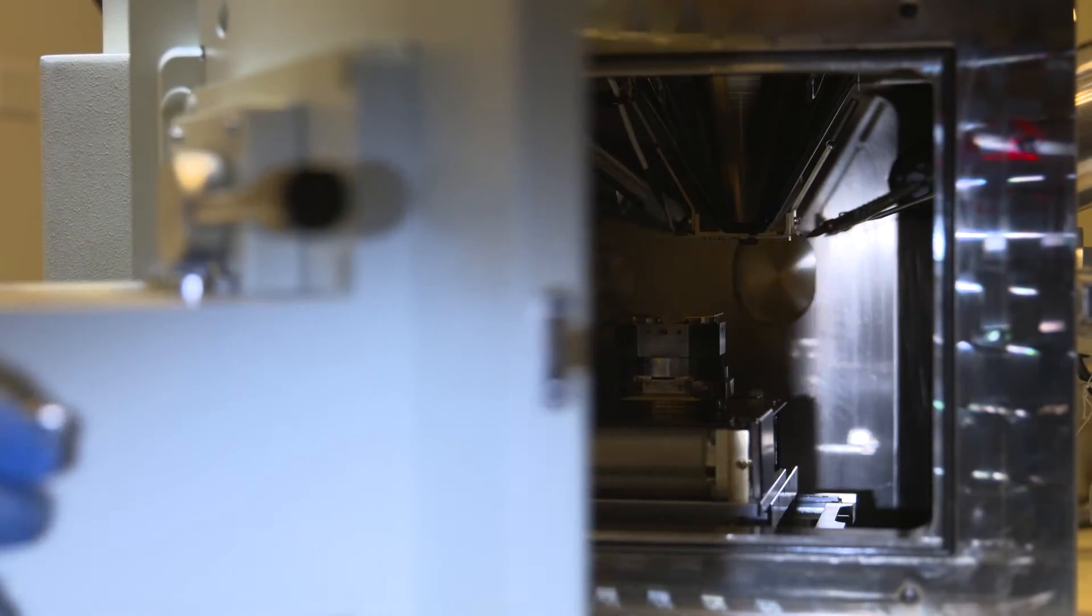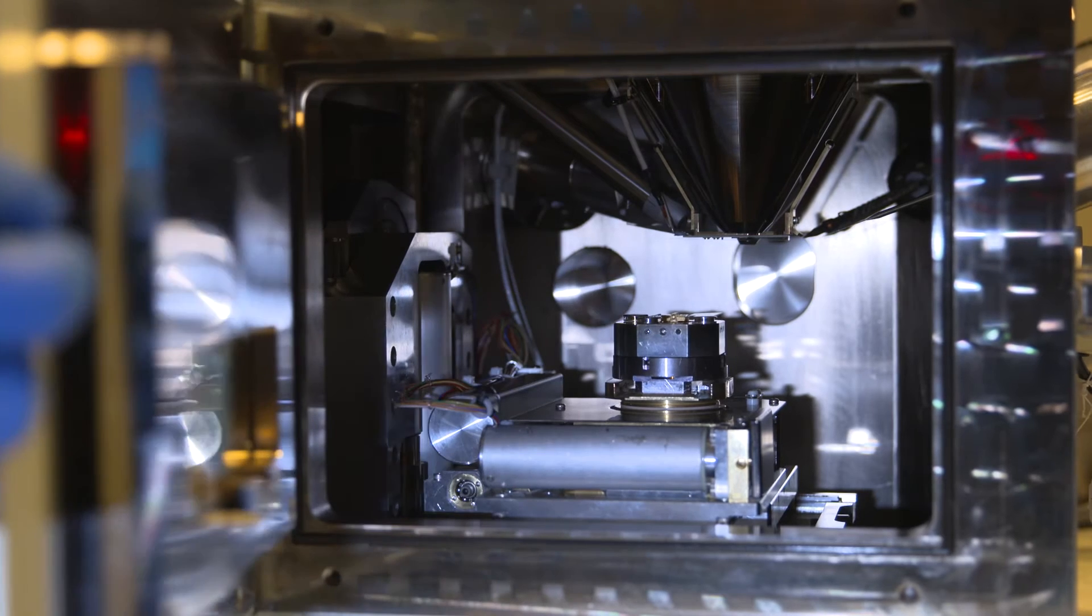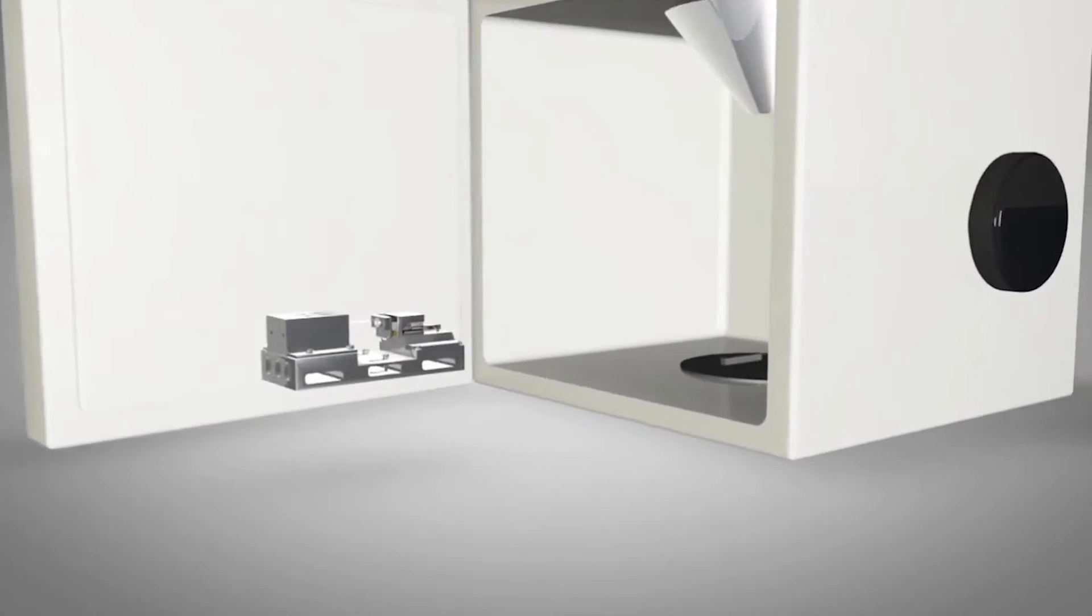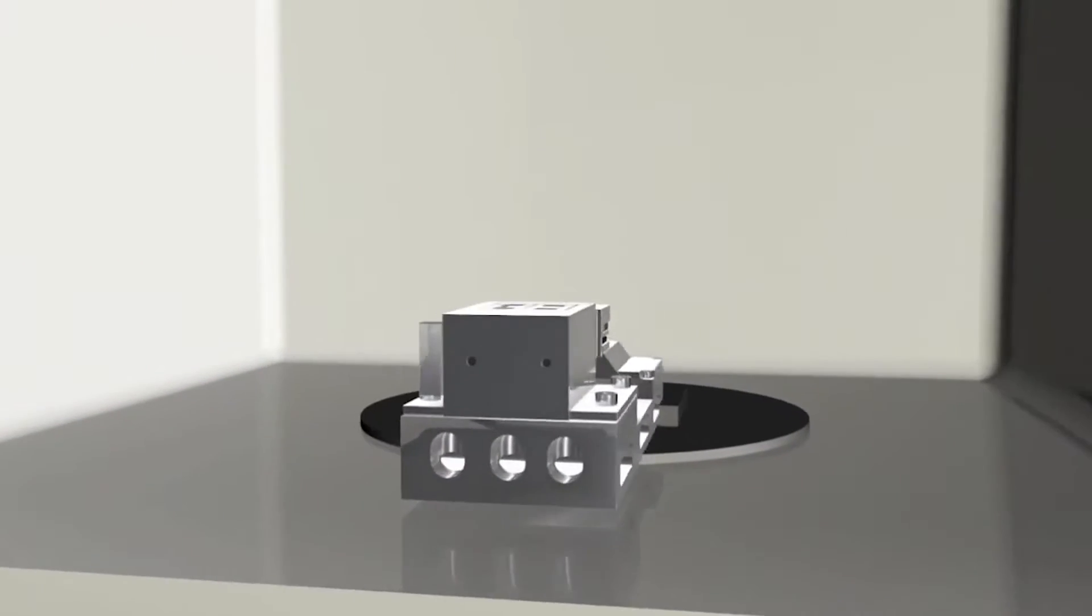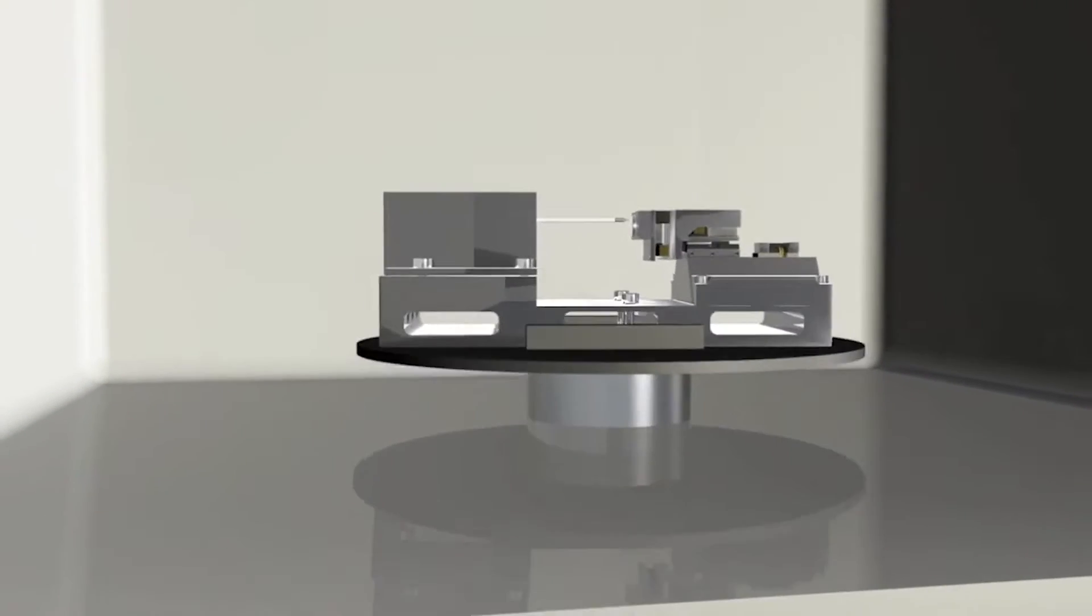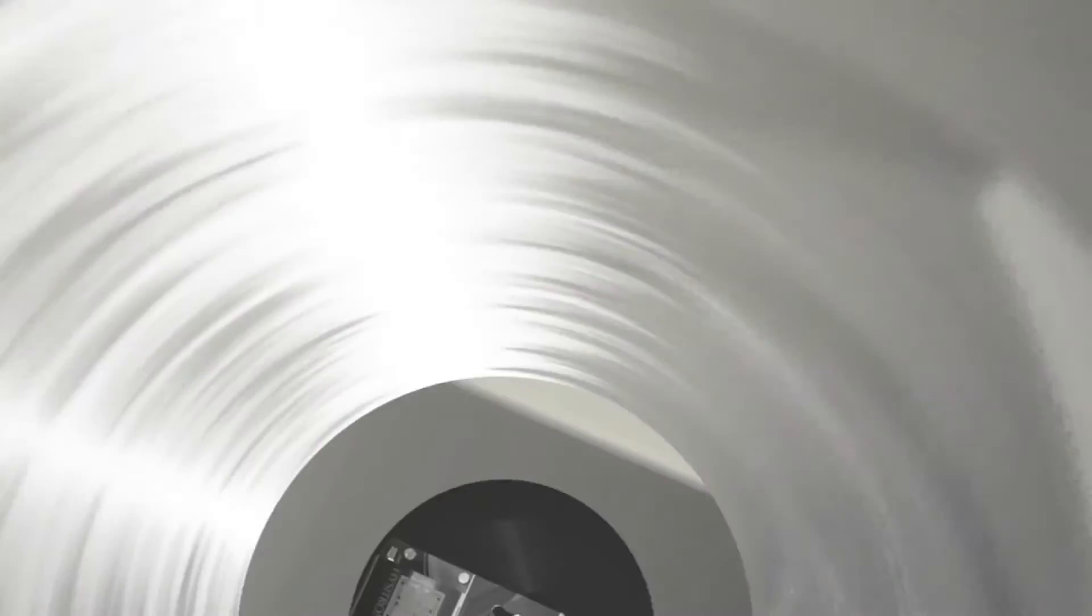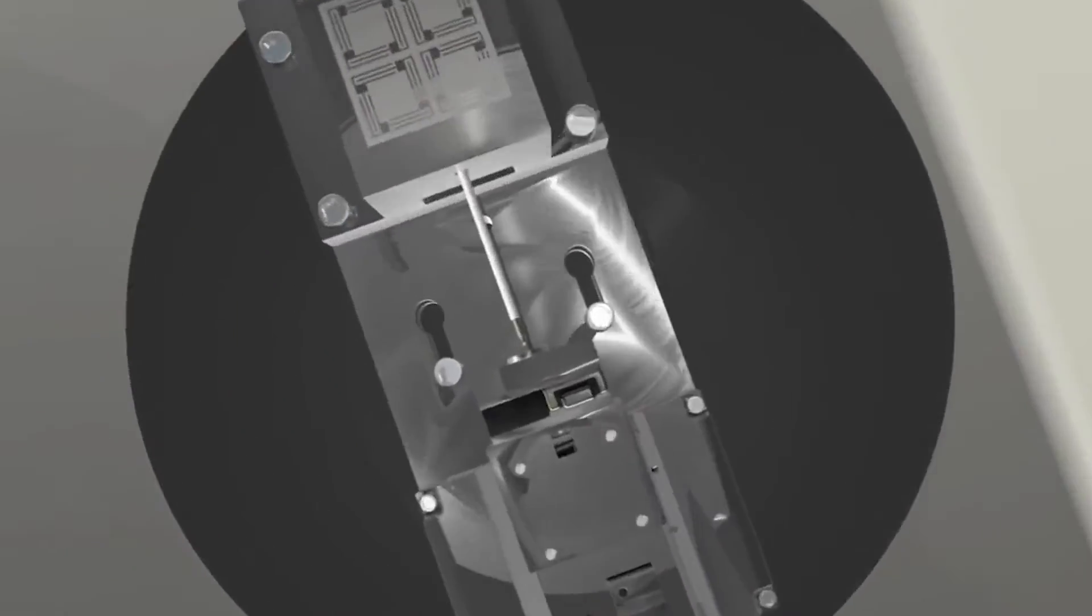Housed within the focused ion beam are two in-situ mechanical testing tools, a micro load frame and an in-situ nano indenter. The combined setup allows researchers to gain new insight into the deformation and failure of materials by linking quantitative load displacement data with high resolution imaging.